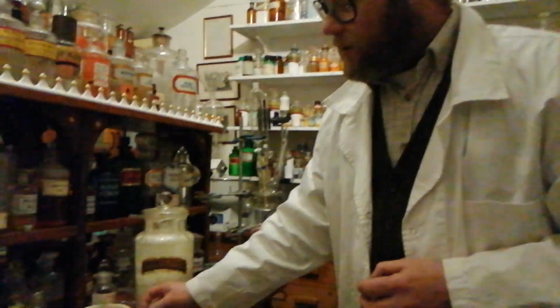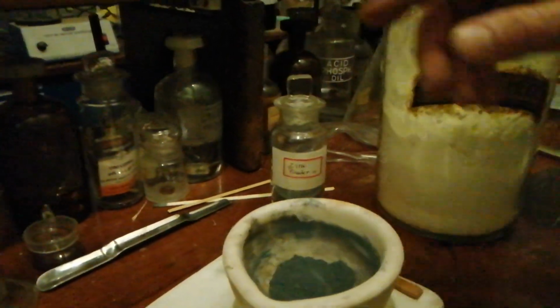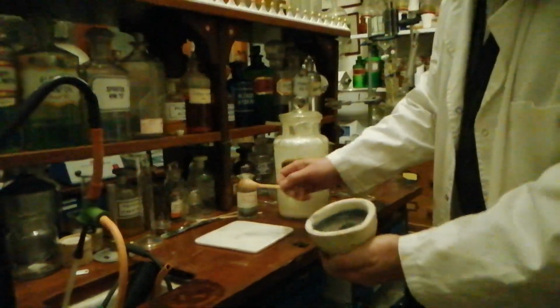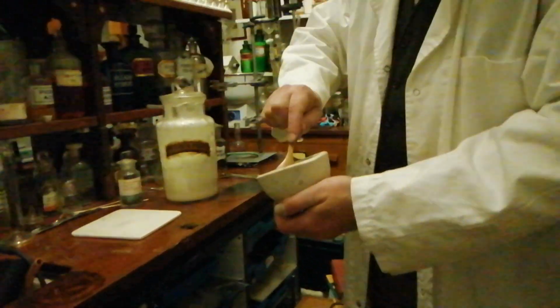Now, on the way past, Mr. Weir decided to mix some zinc powder with some of the sulphur, and in this little mortar here I've got some equal volumes of sulphur and zinc powder, and my assistant and I discovered that with this little wooden spoon you can make a lovely psycho sound.